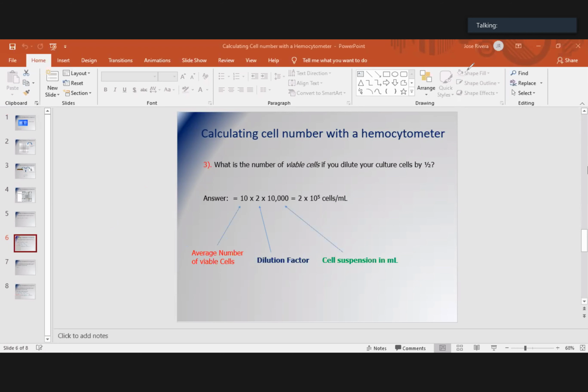It's just because I think of it and I'm like, okay, so we're taking the total and then we're dividing by the 4 quadrants. So when we do that, you get the cell average, and you said that's what we're looking for. But when you look at the value 2.25 cells, it would be an inaccurate statement to say two. Right? So wouldn't we have to, or I don't know. That's why I'm asking.